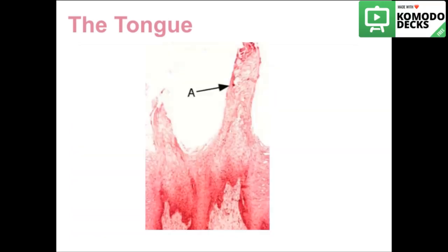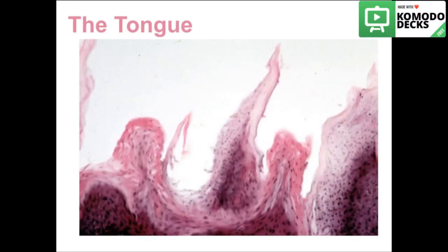A rather magnified section of the filiform papillae, which is an intraepithelial organ. These filiform papillae have no taste buds, so they are only for friction purposes.